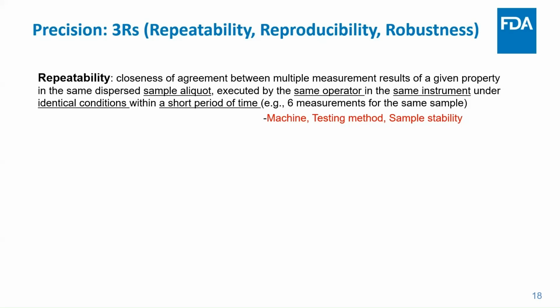It tells you either the machine is not working properly. This can happen, for example if the electronics or flow unit is not working properly, so as a function of time you get different observations, different values. So the first thing it can tell you is that if we do not get the same result, the machine maybe has some problem, or the method is not suitable.